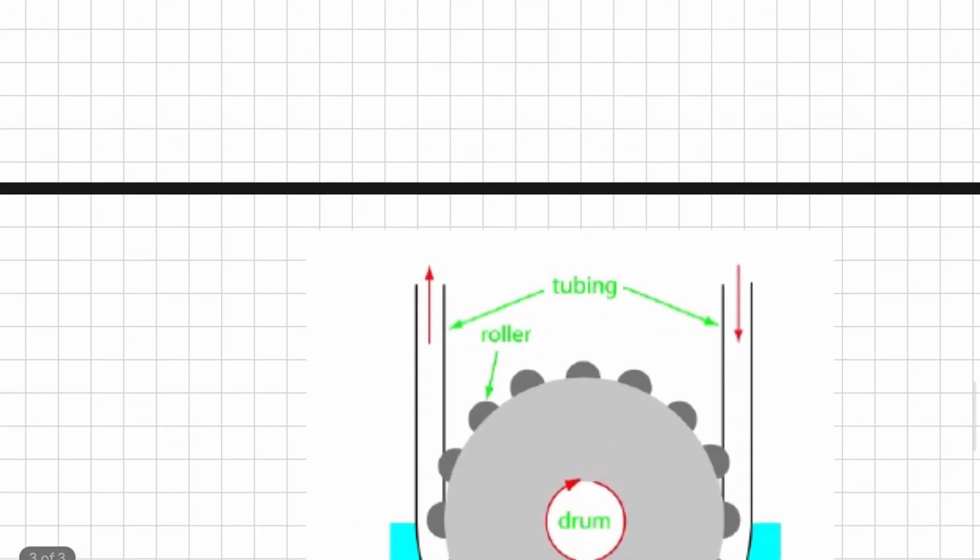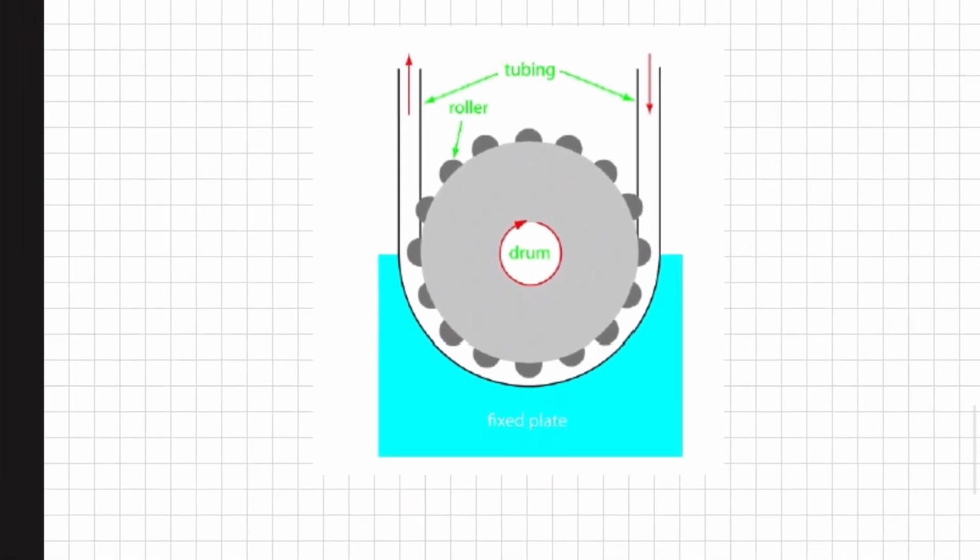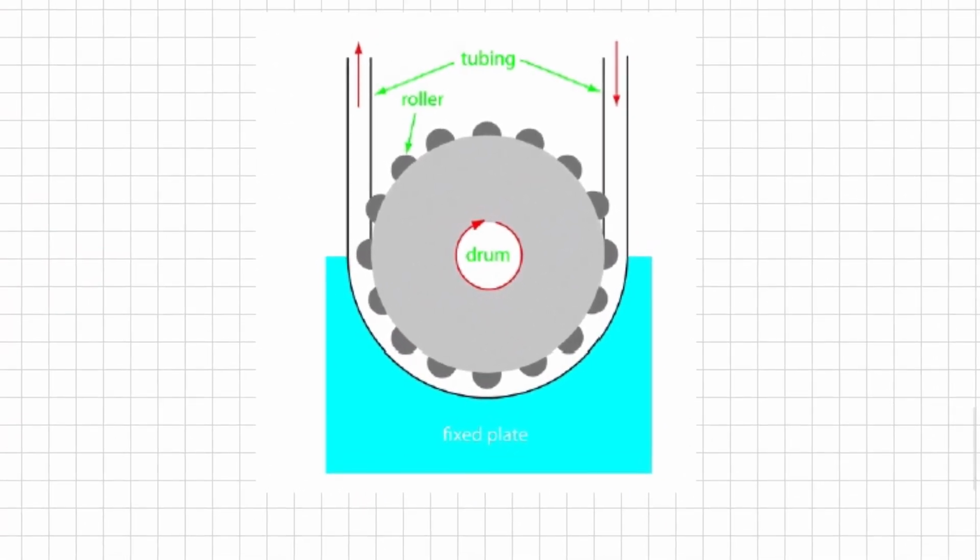Now in this lecture we will discuss these different components, and first of all we will see how the propelling unit works. The propelling unit moves the carrier stream through a flow injection analyzer. Although several types of propelling units have been used, the most common is the peristaltic pump. As shown, this is a peristaltic pump.